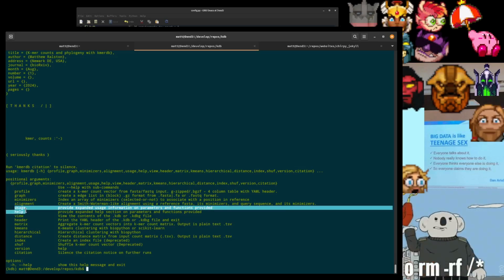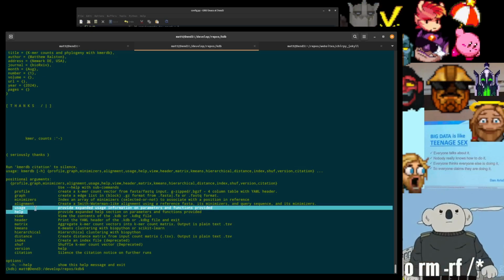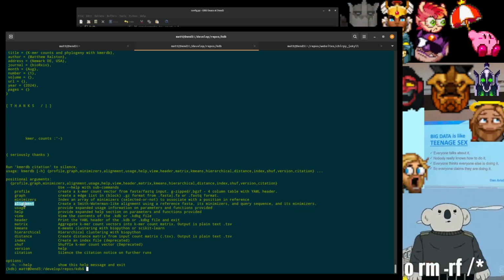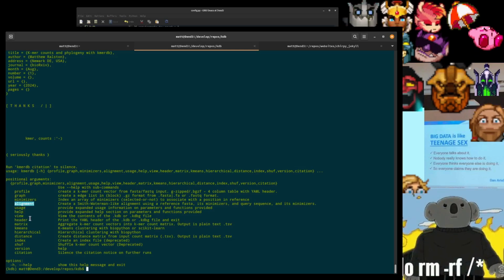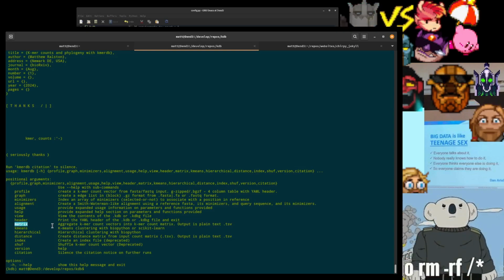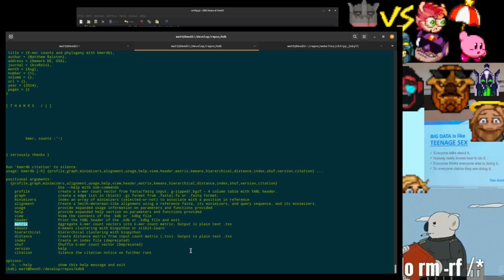I mentioned usage and help. They're the same command. They're distinct from the argparse -h. The alignment function isn't working yet. It's still a work in progress, so it's in there. The matrix command is something that will aggregate count vectors into a count matrix.